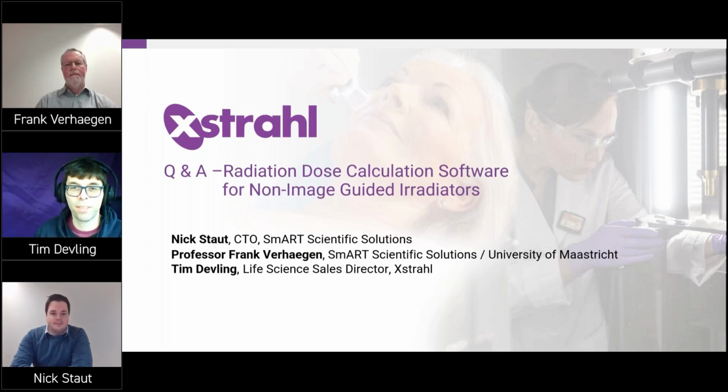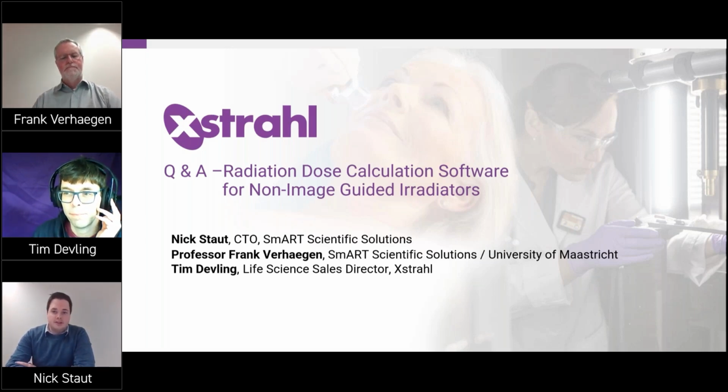Is an obvious question. How long does it take to calculate dose? Well, that's an obvious question, but a simple one. So it depends a bit on what you want. The fast mode, which is more intended for prototyping, so like quickly checking what your dose distribution would do with different setups, that's only a few seconds because you're allowing for larger uncertainties and you're also taking coarser voxels. For a full Monte Carlo simulation, typically, again, it depends a lot on your setup, but it's a few minutes. Unless you're interested in out of field dose, then you need to up the time a bit more to get good statistics.